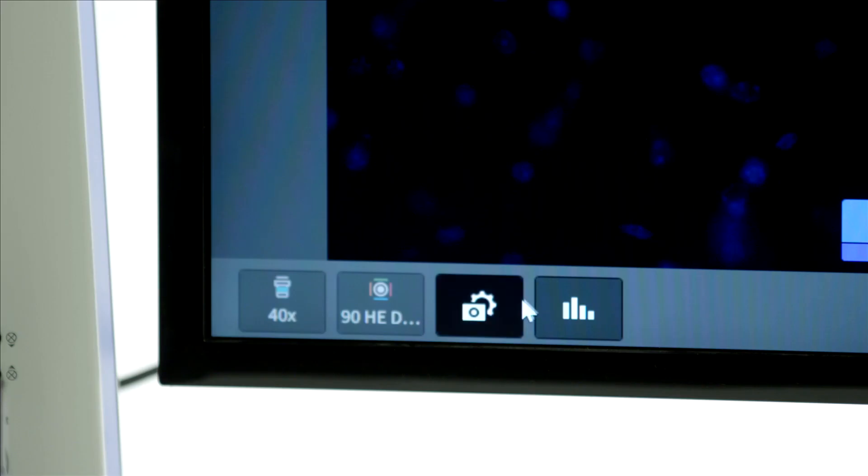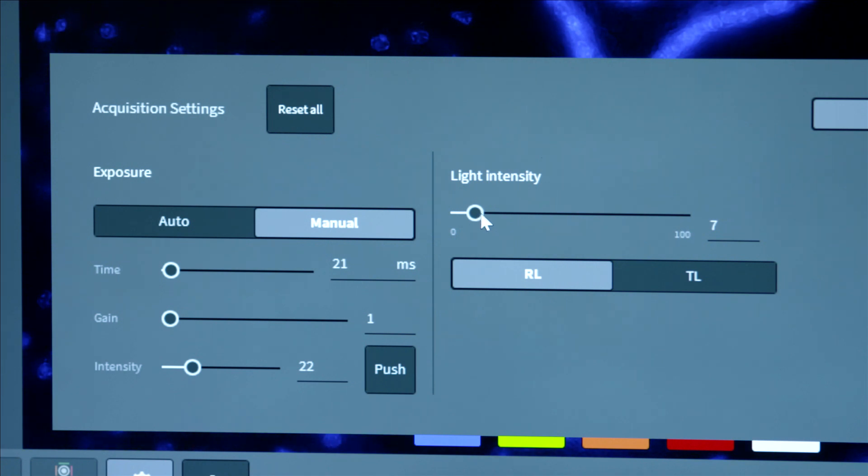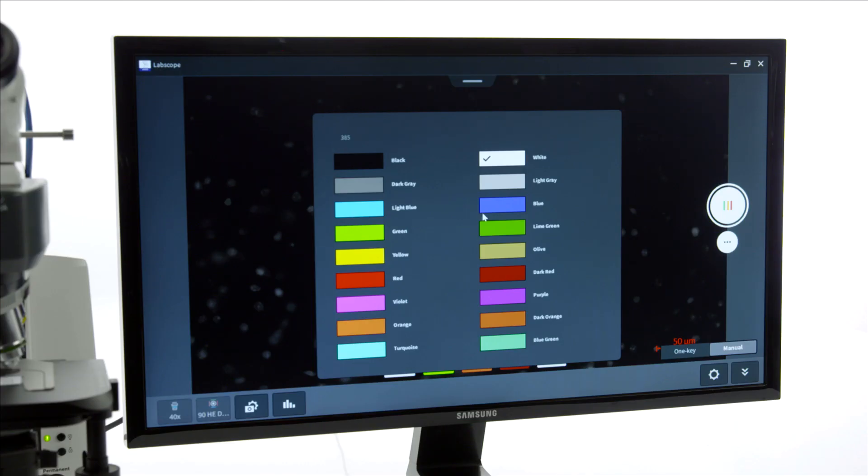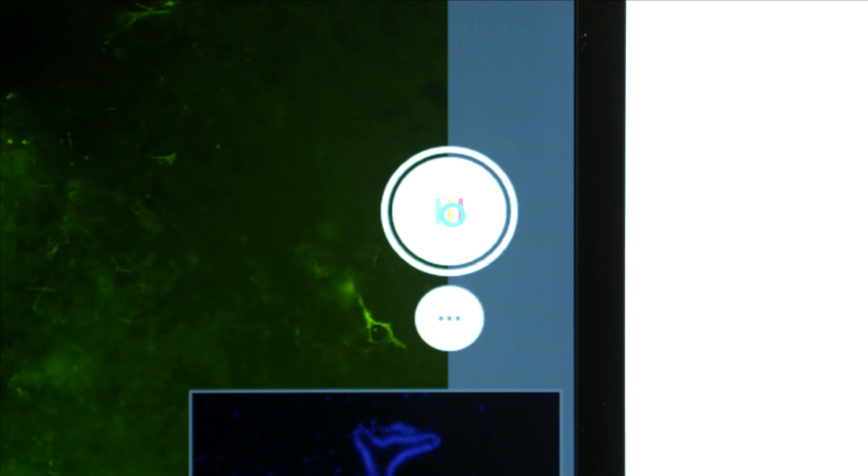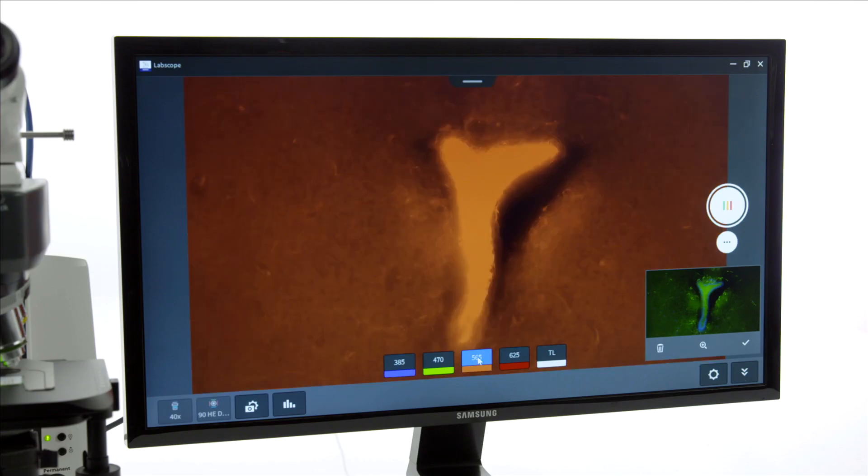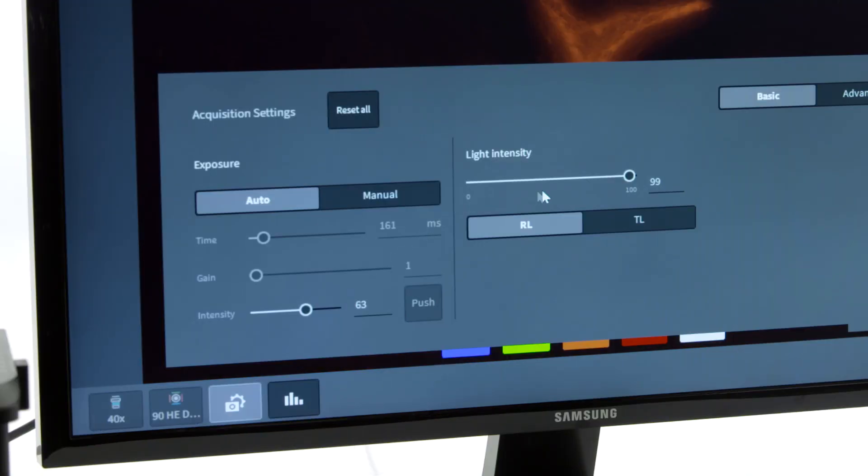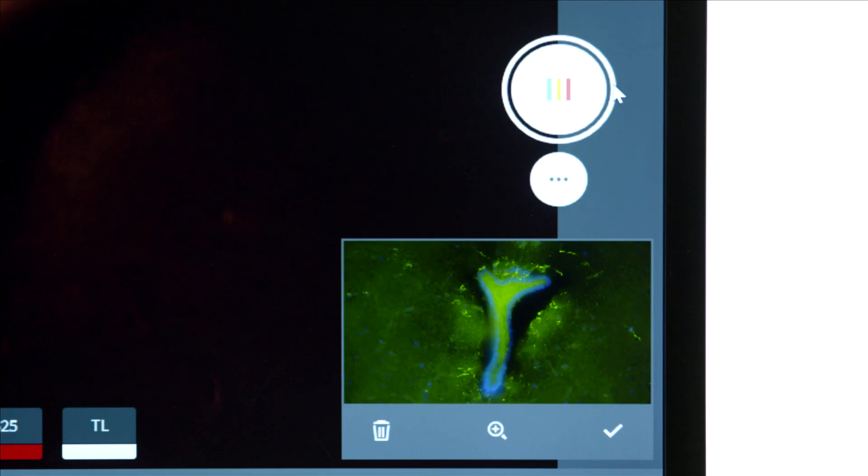Set exposure time, light intensity of the active fluorescence LED and configure a false color. Then press Snap. Change the channel, refocus if necessary and repeat the procedure until all channels are acquired.